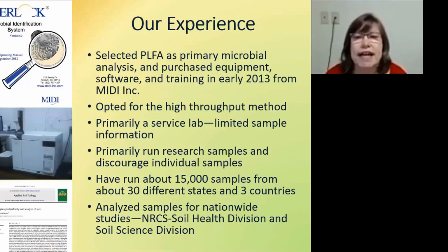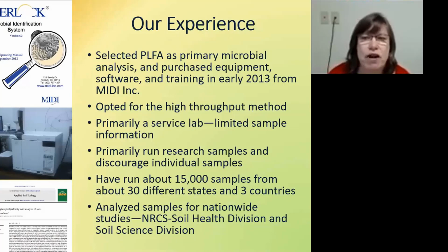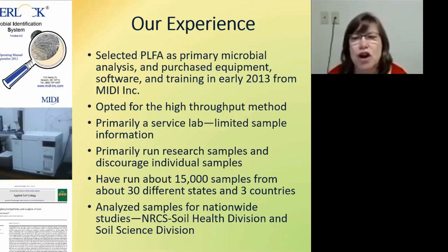So after we selected that as our primary microbial analysis, we purchased the equipment, software, and training in early 2013 from MIDI Incorporated. They have the Sherlock Microbial Identification System, and that is the software we use with our gas chromatograph. And there were different methods.